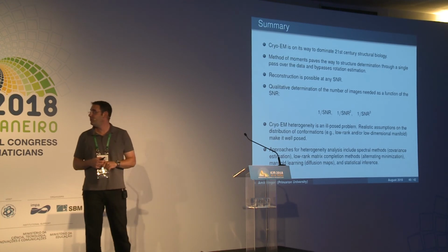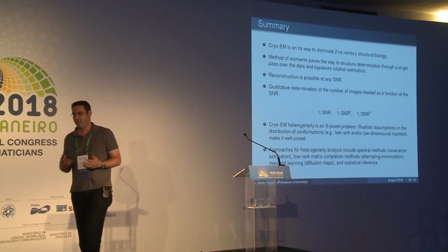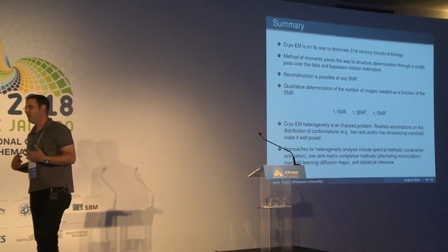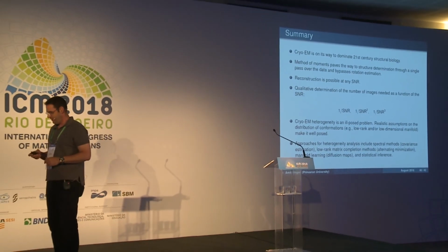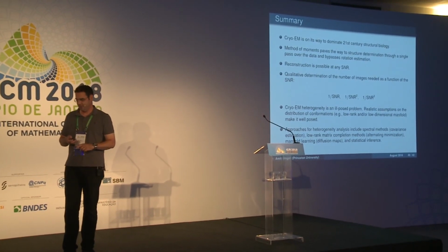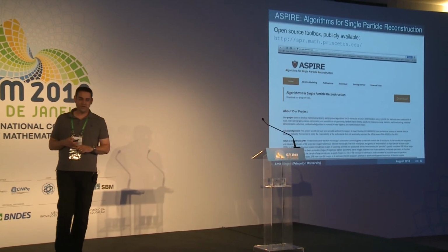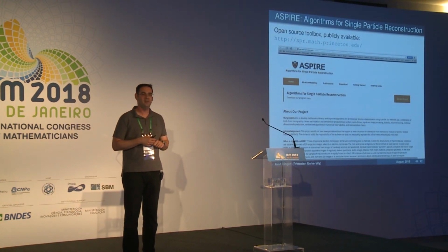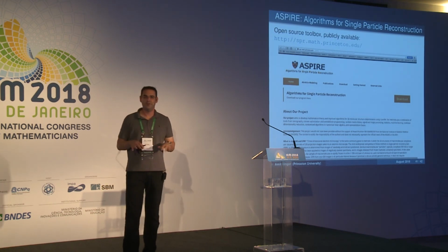And we discussed the cryo-EM heterogeneity problem, which is widely believed to be the most important and crucial open problem in the field, if you listen to Frank and Henderson, who got their Nobel Prizes. I would like to mention that we have an open source toolbox where you can play with everything that I talked about today, if you want to get your feet wet.